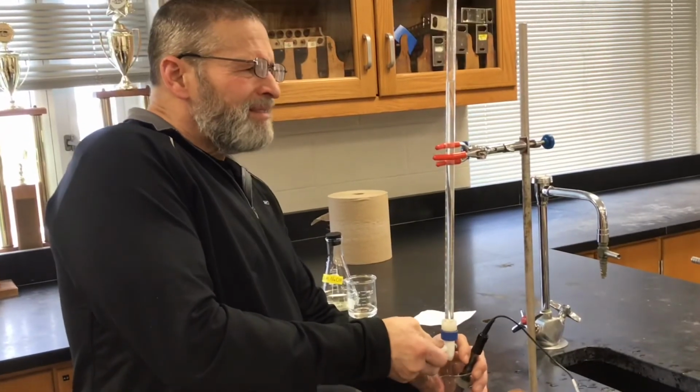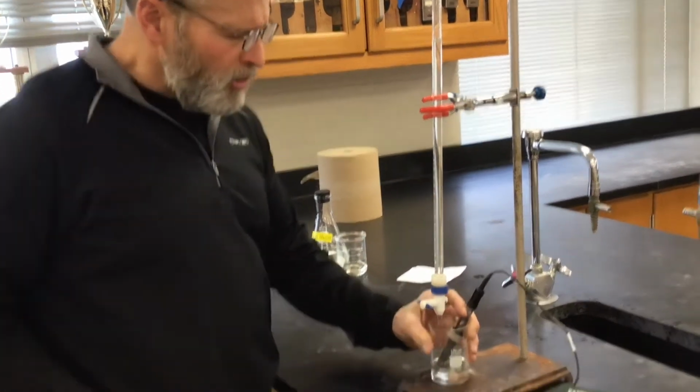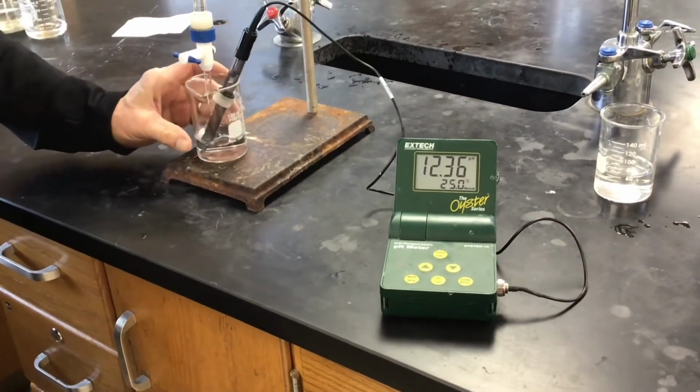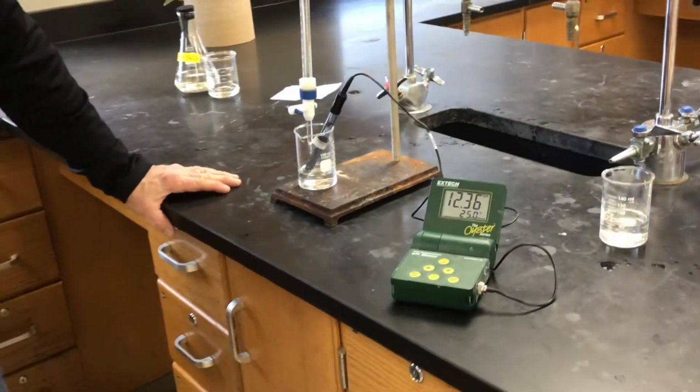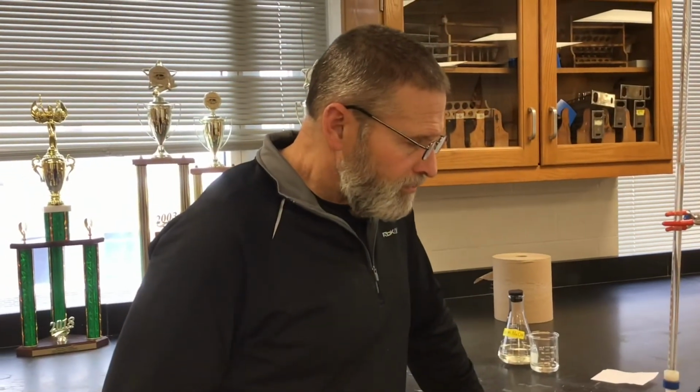Okay. One more for good measure. There's 21. All right. So we had 20 ml of a strong acid, and we want to know its concentration. Sample 3.